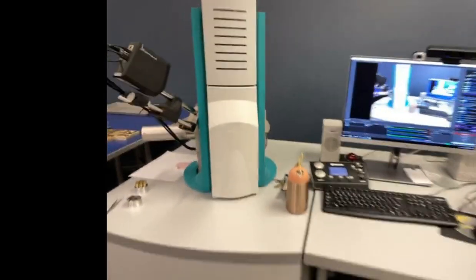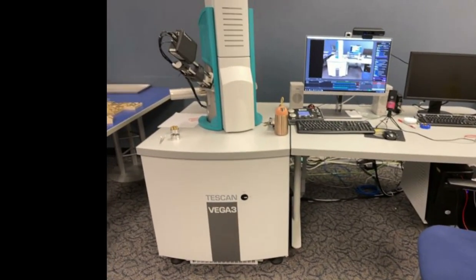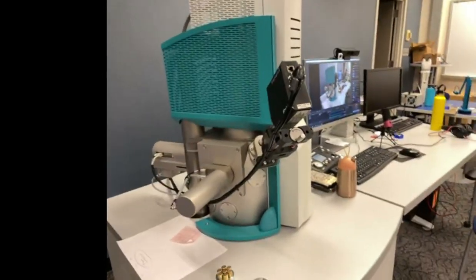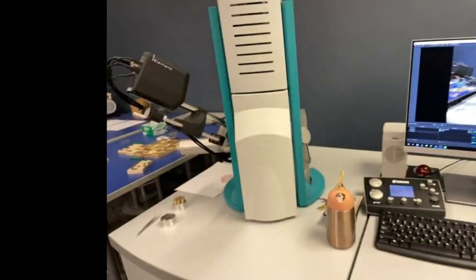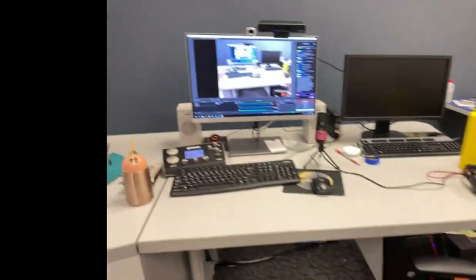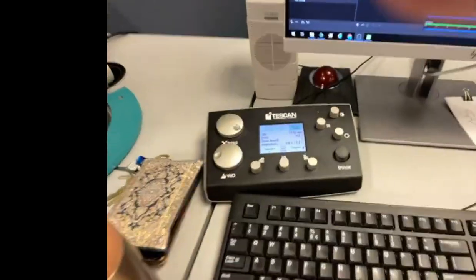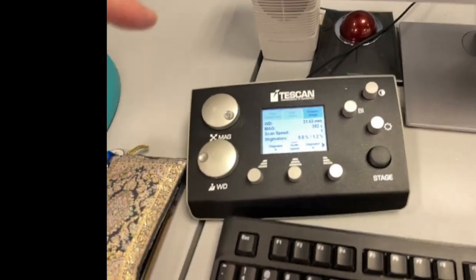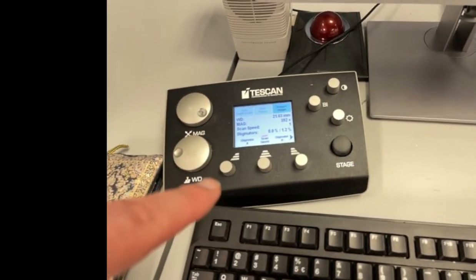While we're here, I guess I could showcase the SEM itself. This is the Tescan Vega 3 scanning electron microscope. It's like maybe two computer towers stacked on top of each other in size. The desk comes with the actual SEM. That computer down there, with the wires coming out of it, is our computer that we're using. And then this is the microphone. This is the little panel that we use to control the scanning electron microscope. The top wheel is magnification, the bottom wheel is the focus. And these little tiny knobs are for fine focus and that sort of thing.